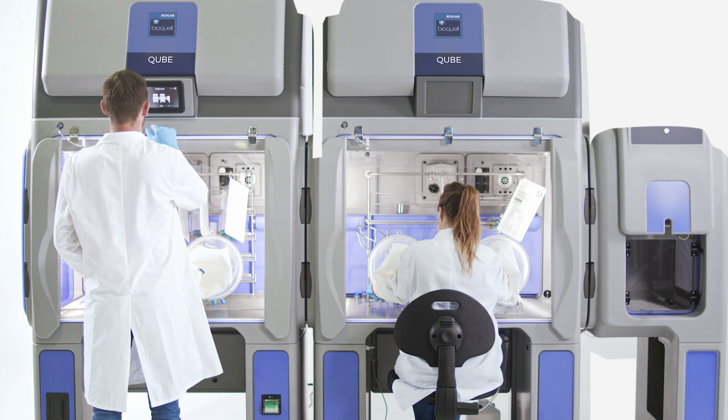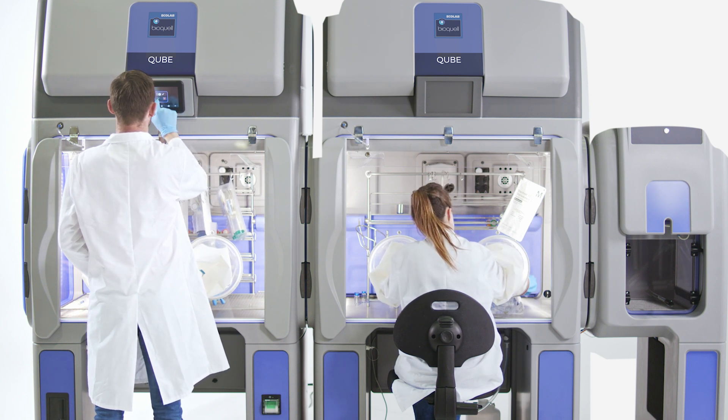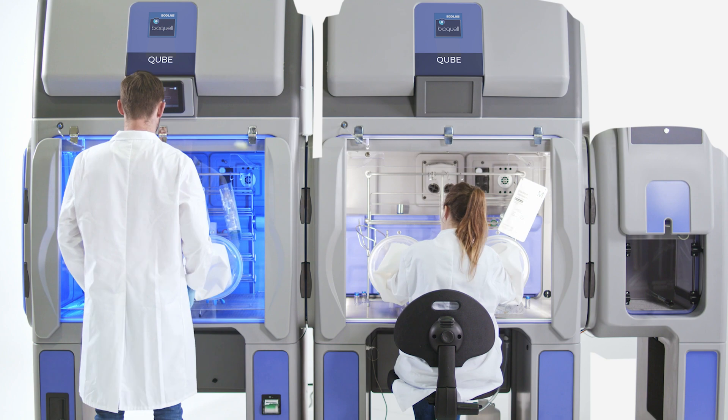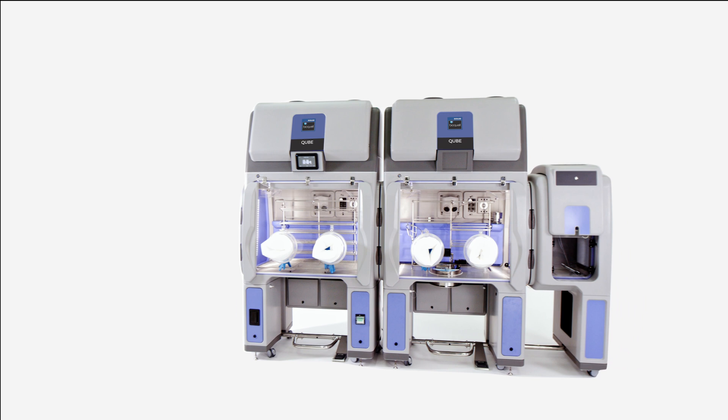Globally accepted, with hundreds of chambers currently installed and in use with world leaders in biopharmaceutical, laboratory research and biotechnology, the BioQuell Cube delivers unparalleled efficiency.